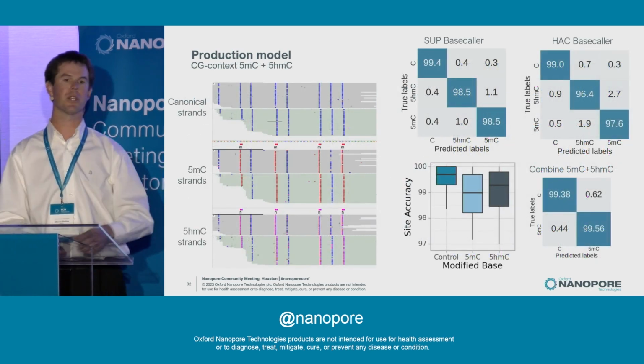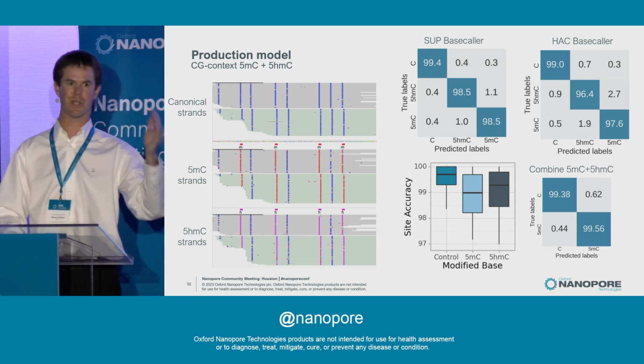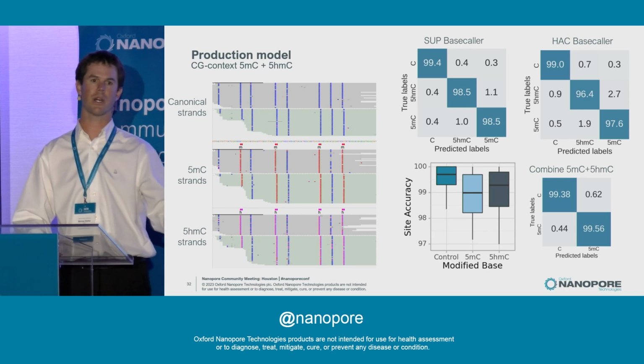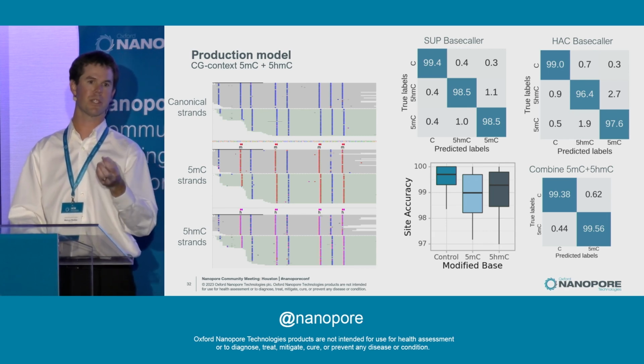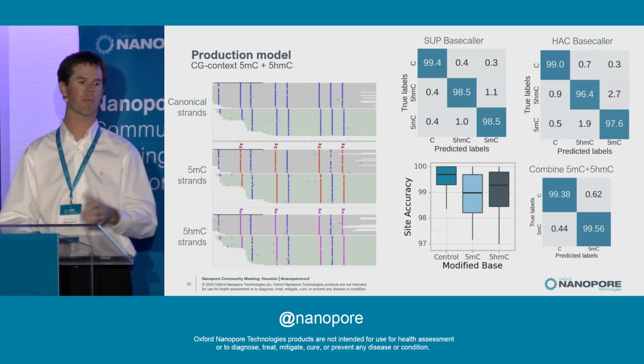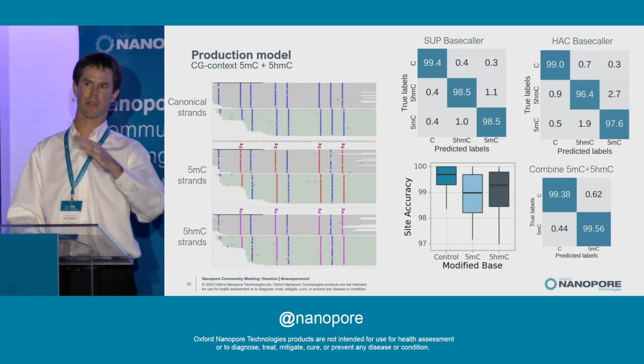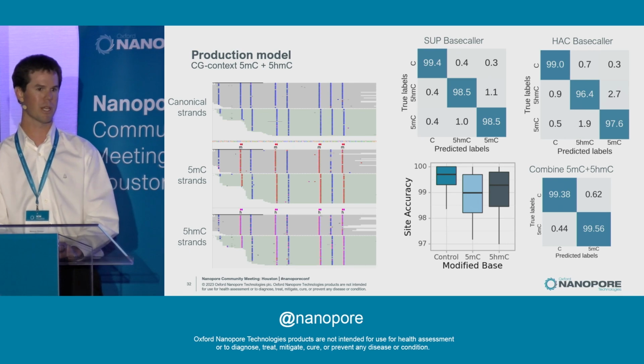Additionally, we have CpG context models. That's sort of the bread and butter that we started with. And what we're doing now is we have the all context models, and you can grab the CG context out of those. It runs a bit more compute efficiently and we get much higher accuracy. The CG context gives a little more signal diversity, and it makes the calls a bit easier.